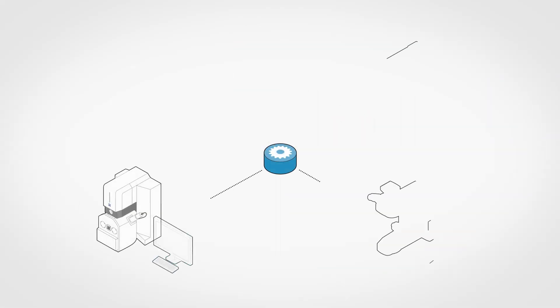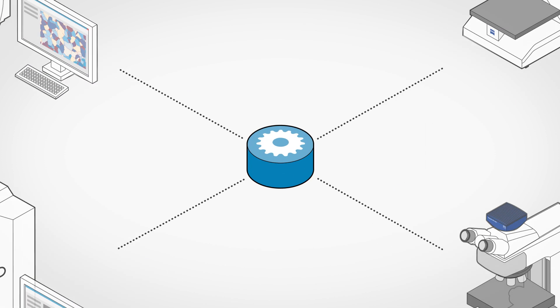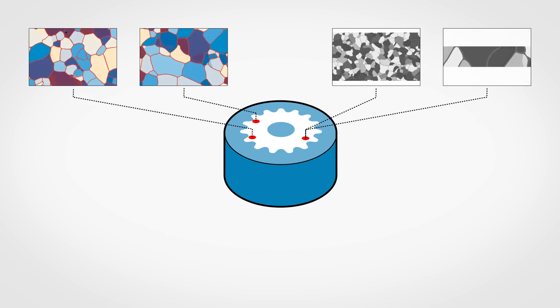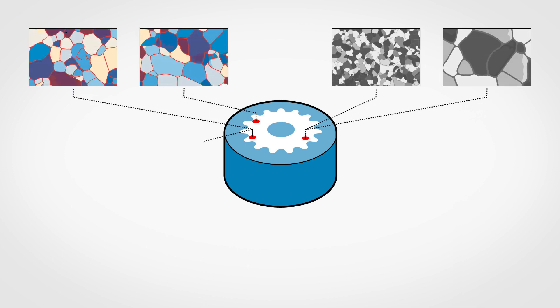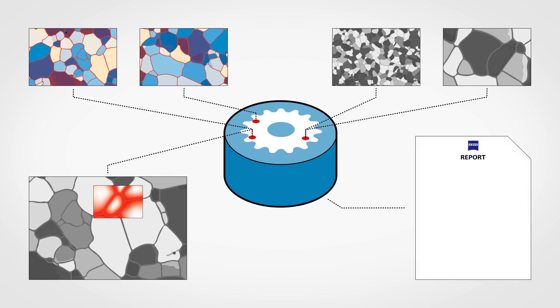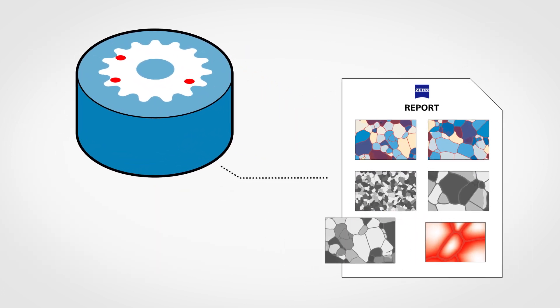ZenConnect is your solution, keeping all data from multiple sources together. Different regions of interest of the sample, smaller and larger details, the results of different analysis methods — all connected in correlative overlays. Reporting across the entire sample becomes easy, giving you all the information you need.